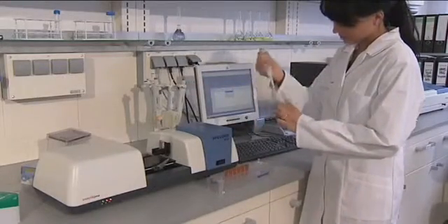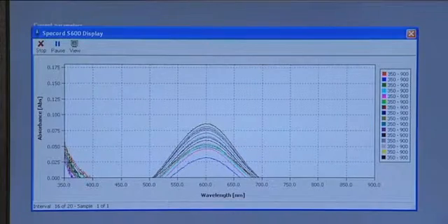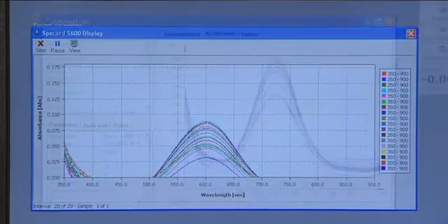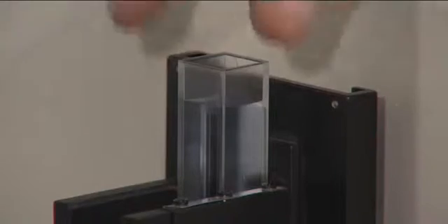Because of its rapidity and easy usability, the Spicord S600 is excellently suitable for fast kinetics. The time-dependent measurement can take place for the whole spectral range. As a consequence, the evaluation of any wavelength is possible.